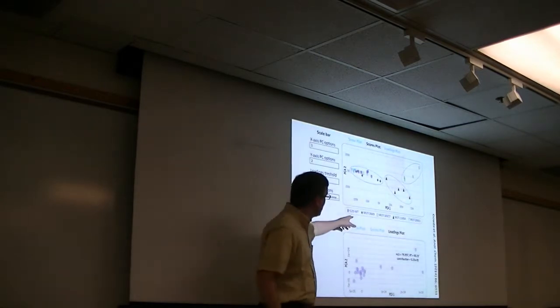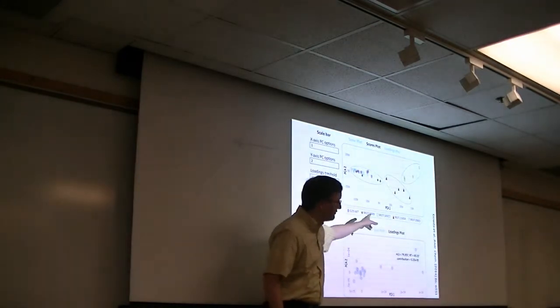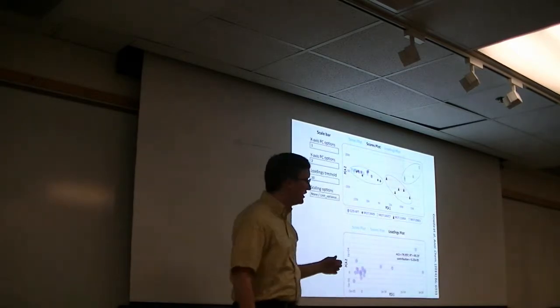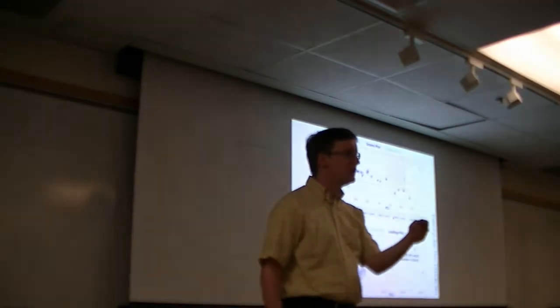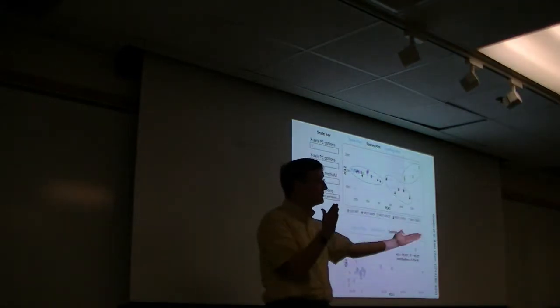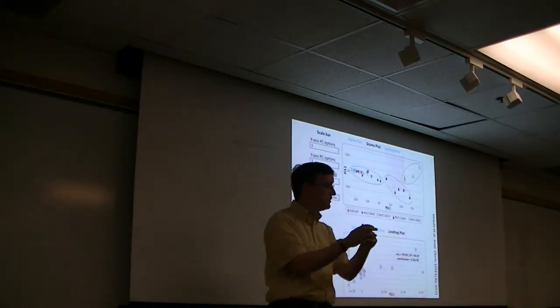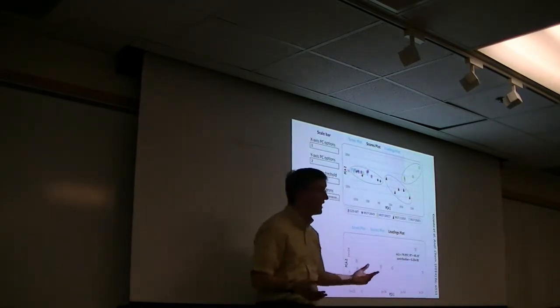So in this case, we're working over, I believe, the same data set, and we're looking at how these different experiments play out over principal component space. Loadings give us some ability to ask how much individual ions are contributing to it. You may have observed that principal component 1 is very good for separating samples of this class from samples of that class. And now you want to know which metabolites are contributing to this separation. So you might look at the loadings for principal component 1 to figure that out.